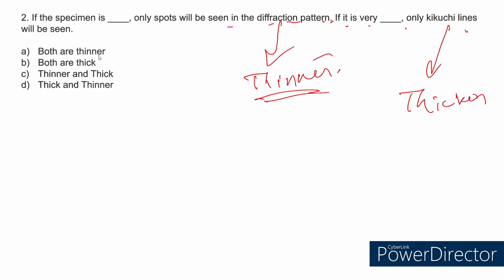If the sample thickness is thinner, then we will be able to see the spot diffraction pattern, and if it is thicker, then we will see the Kikuchi pattern.